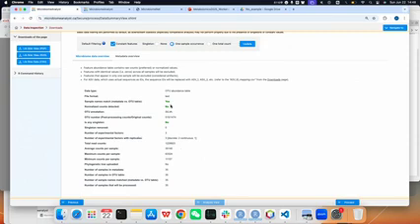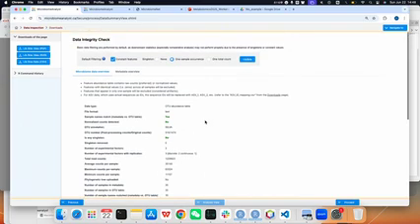If your data is not totally matched, we will have an error message, and then you need to reformat your data. Here we can see the first row, there's a default filtering. We usually remove those features that only appear in one sample because we think that's maybe noise, or it's not the main feature we are interested in.